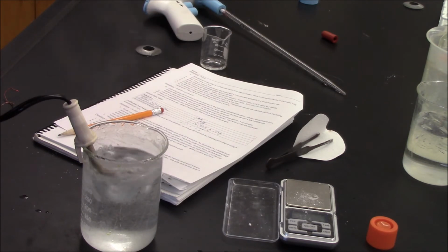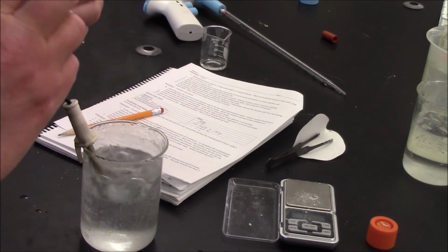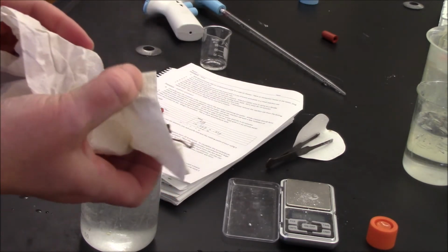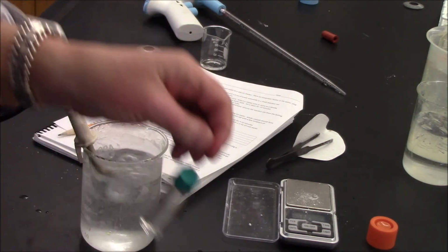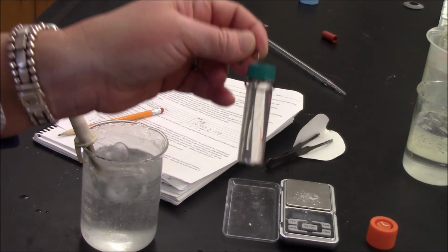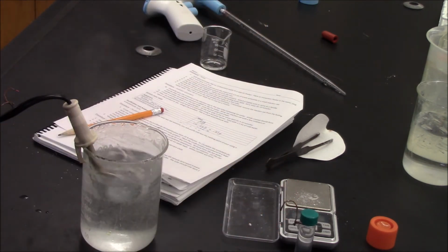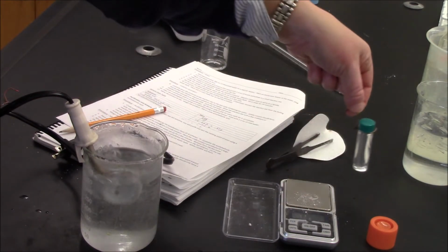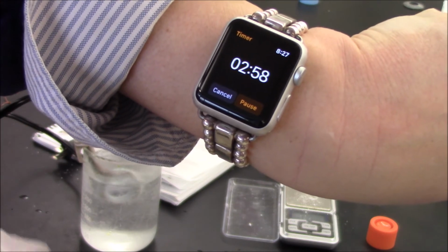I use a paper towel. You can't see it on the screen. I'll bring it into the screen in a minute, but I'm trying to hold this and invert my vial several times in order to ensure thorough mixing. Now it's time that I let my vial cool on my desktop, so I'll set the timer for another few minutes. See you then.